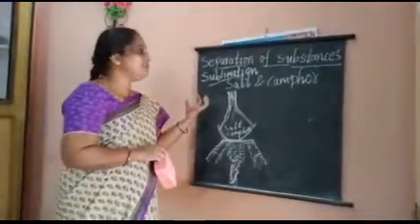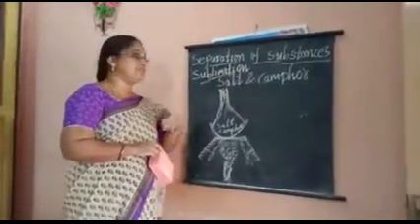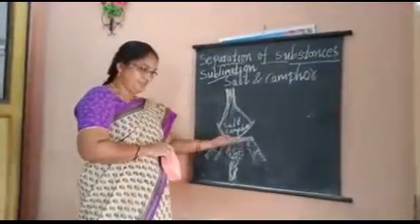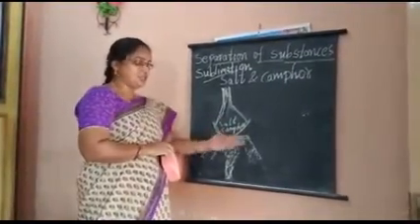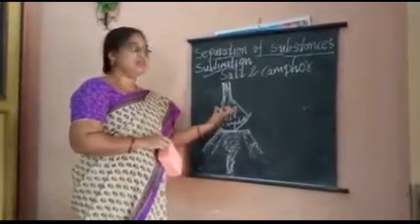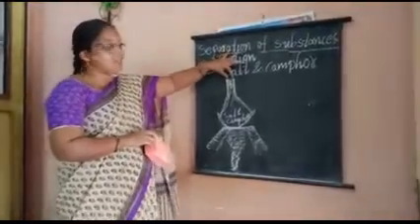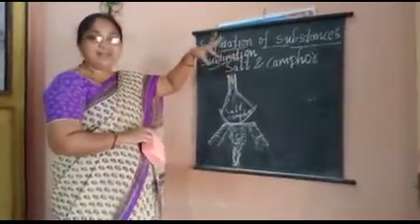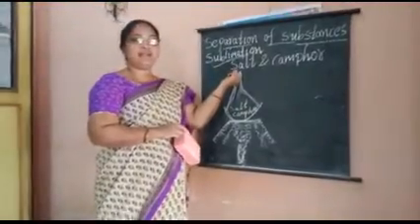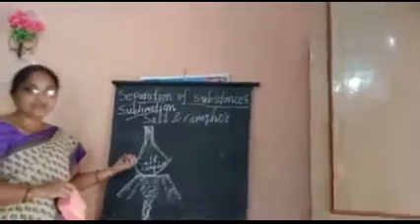How can we separate camphor from the salt and camphor mixture? Take a china dish, take that mixture, place the dish on a stand, and invert a funnel. ఒక గరాట్ తీసుకోండి, దాన్ని మీరు దీని మీద బోర్లించండి, and plug some cotton at the stem of the funnel. ఒక కాటన్ కొంచెం ఈ చివర స్టెమ్ దగ్గర, గరాట్ కాడ దగ్గర కనుక ఉంచినట్లయితే ఉంచండి, ఉంచి హీట్ చేయండి.